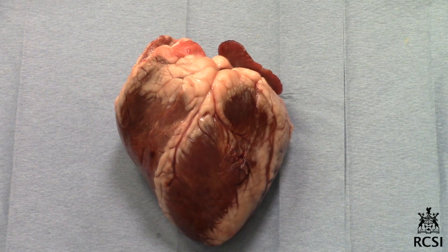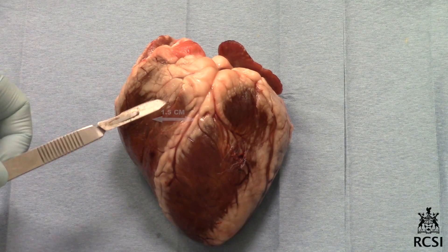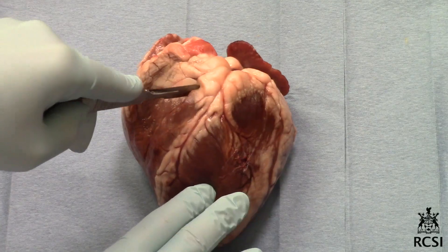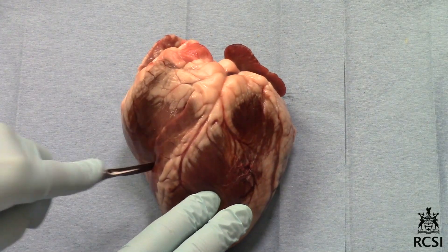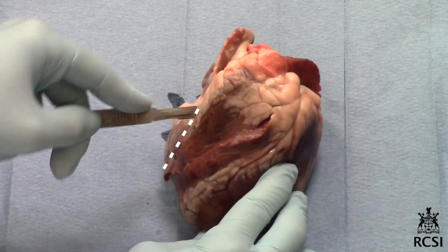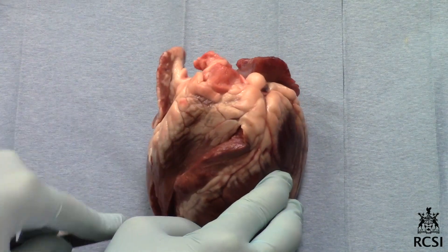Start the dissection with the right atrium and ventricle. Make an incision 1.5 cm to the left and parallel to the longitudinal sulcus from the pulmonary artery to the base of the right ventricle. Make a second incision from the right atrium down to the base of the ventricle to meet the initial incision.